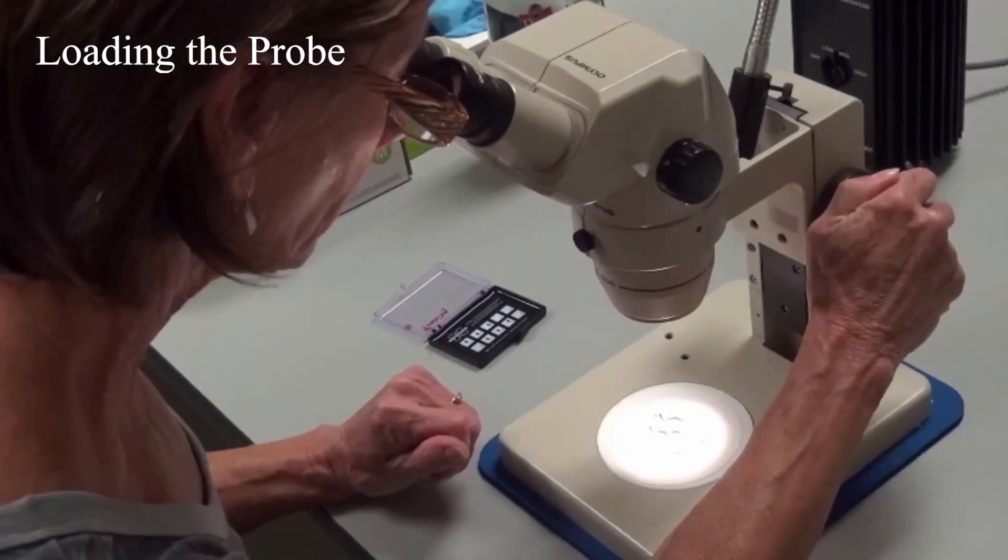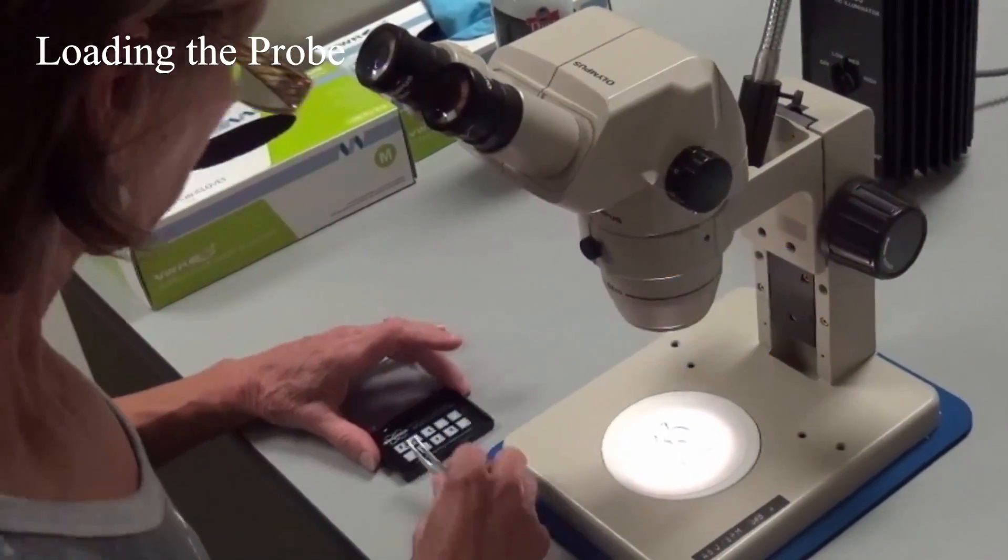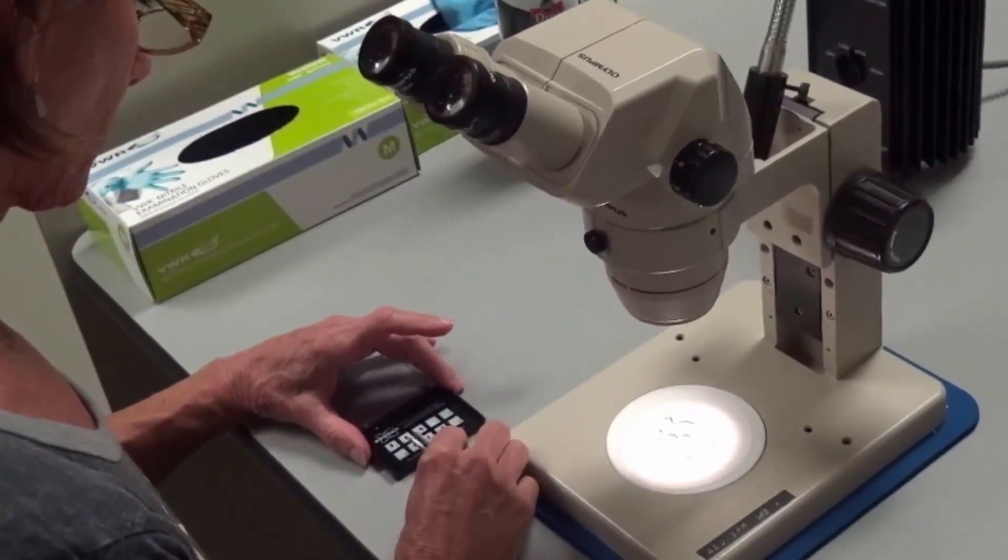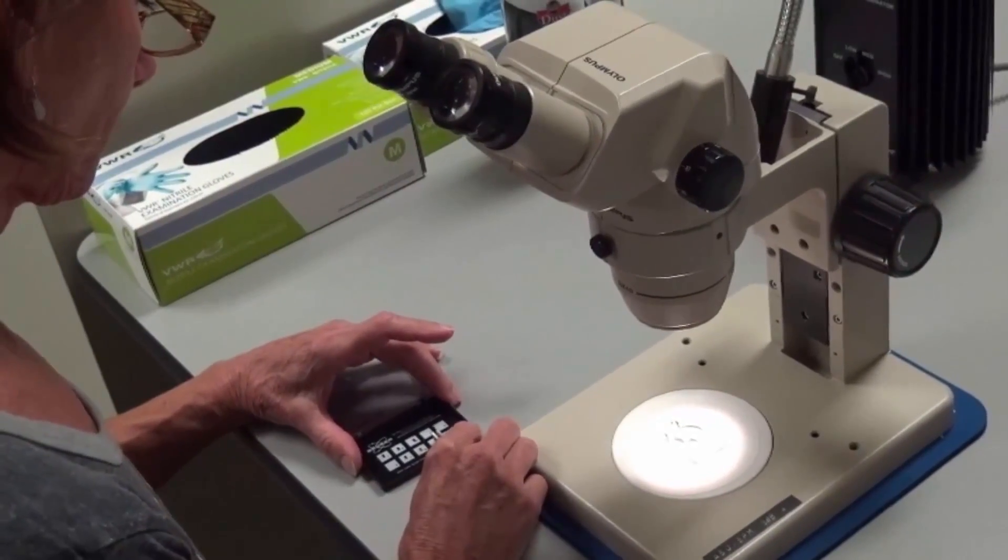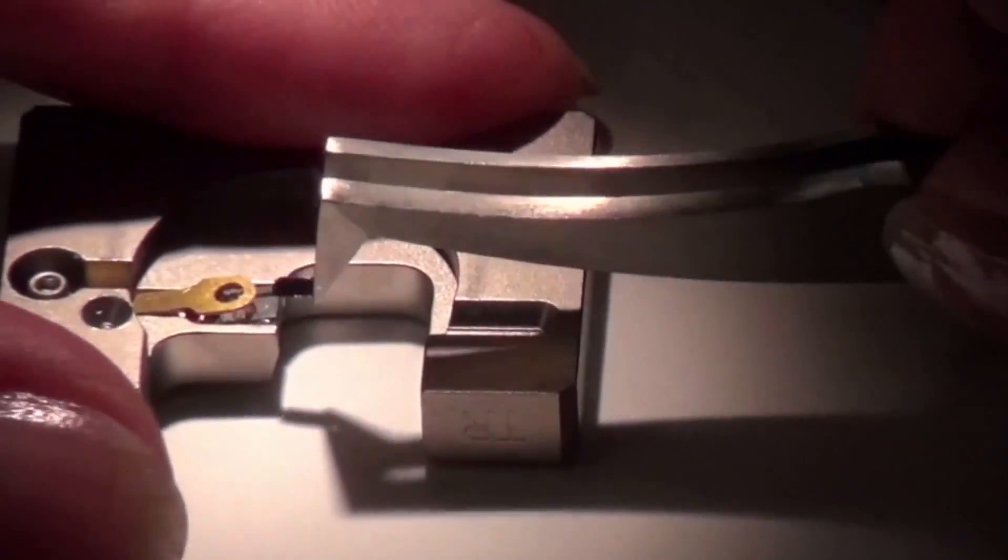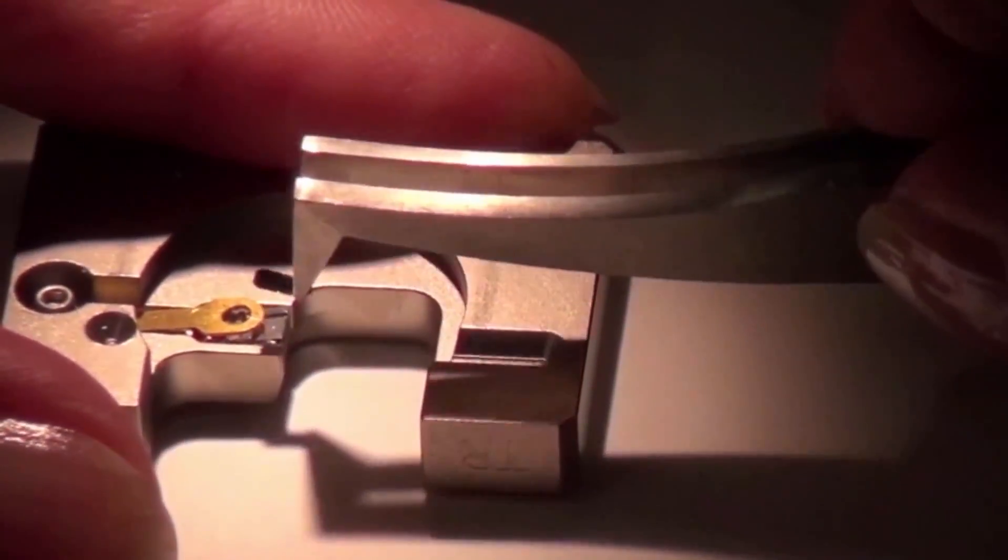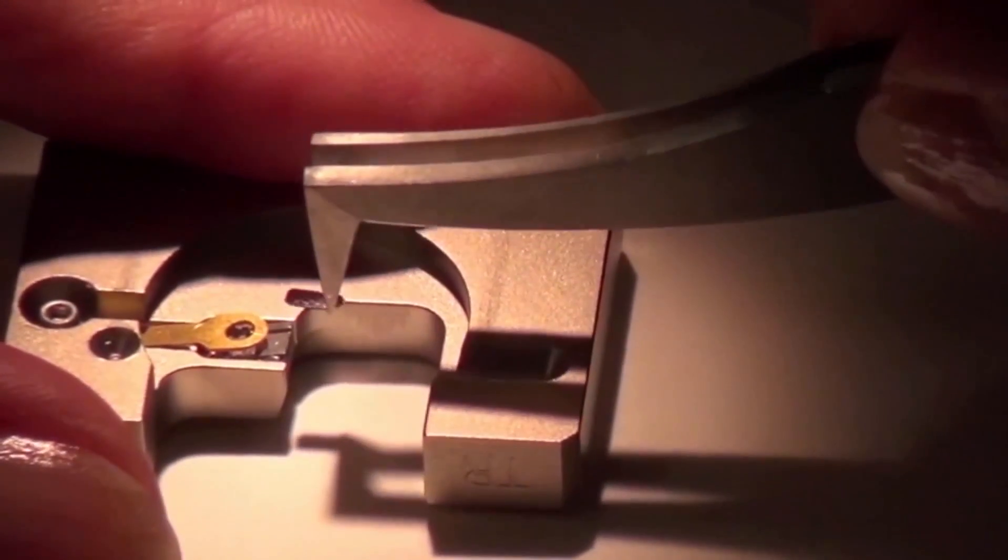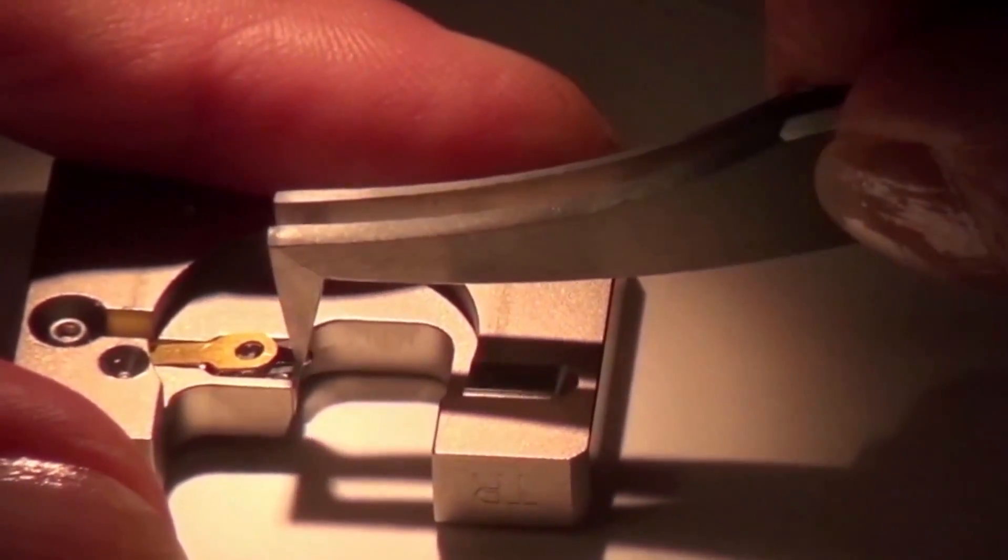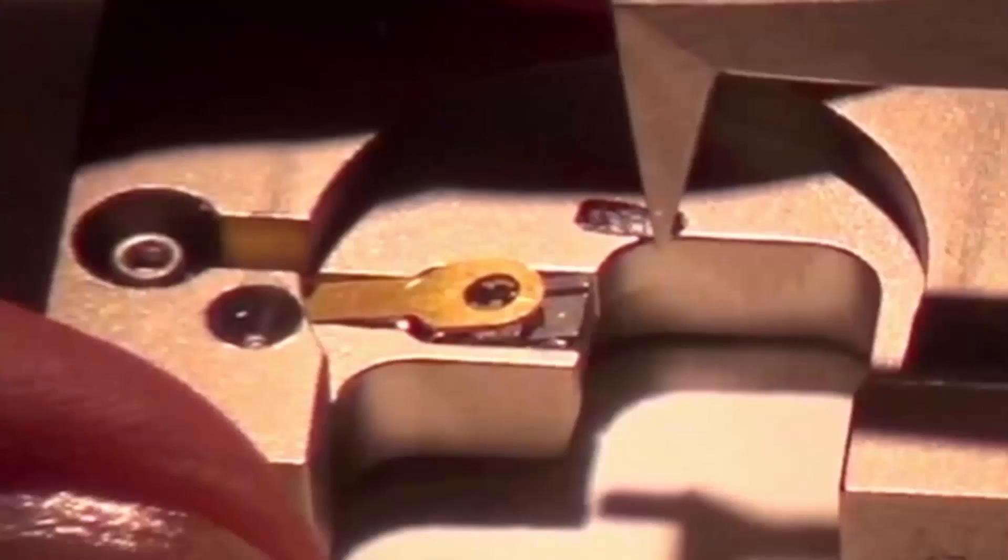Place the probe holder clip side up on the filter paper on the microscope stage. Push down on the holder to raise the clip. Using the angled needle nose tweezers, guide the probe under the clip to place it within the recess of the holder.